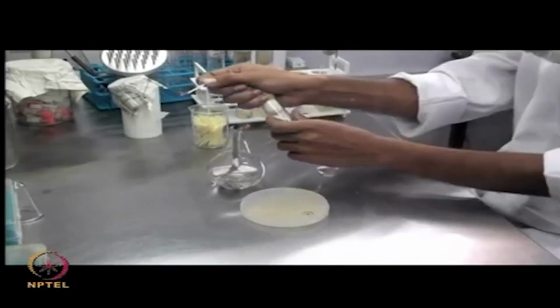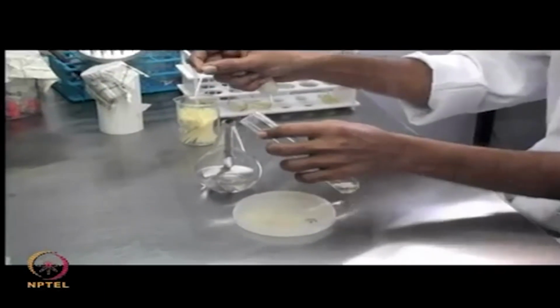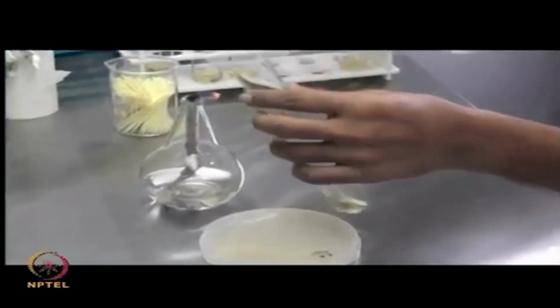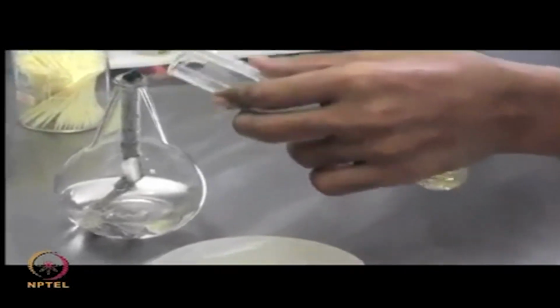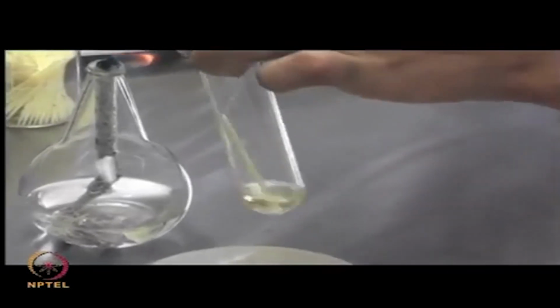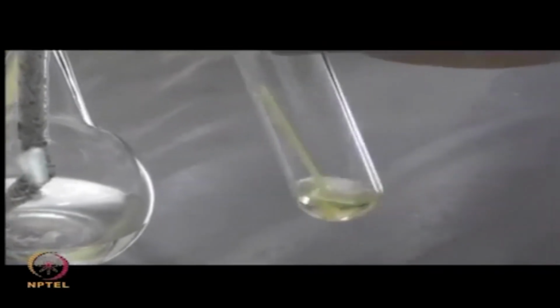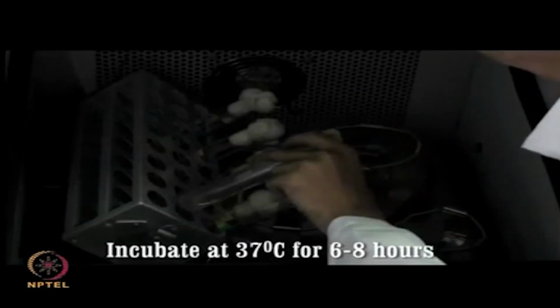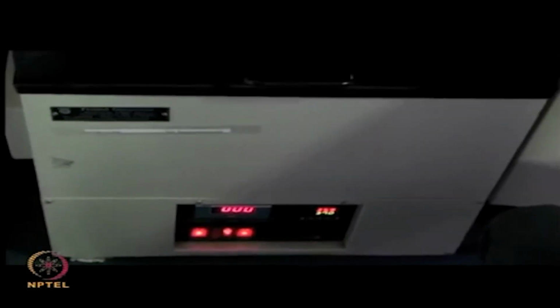Carefully remove a bacterial colony from the master plate and inoculate the autoclaved growth media. Incubate this inoculated sample at 37 degrees Celsius for 6 to 8 hours with constant shaking to allow the bacteria to grow.